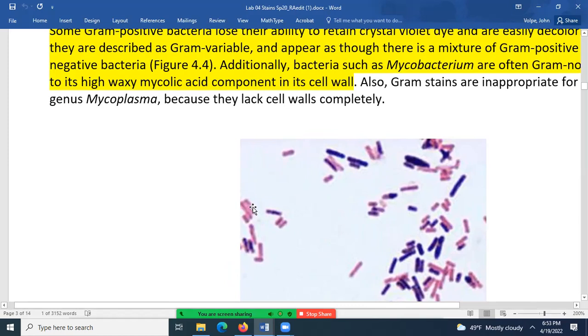And what happened was this cell is a dead cell. So was that one and that one. And that's why the cell is ghostly. Not all of the cell is there. And the dead cells, because not all the cell is there, it's not staining correctly with the gram stain. And that's why they're gram negatively stained.